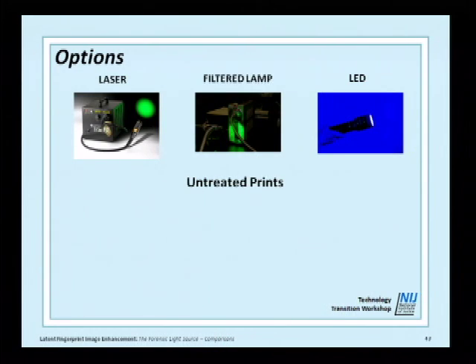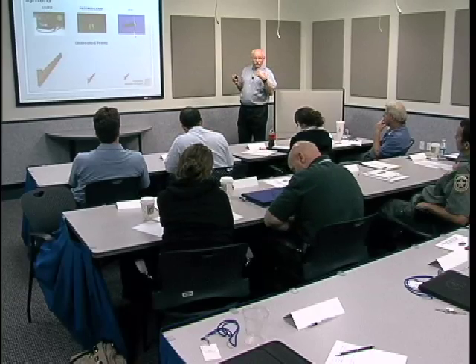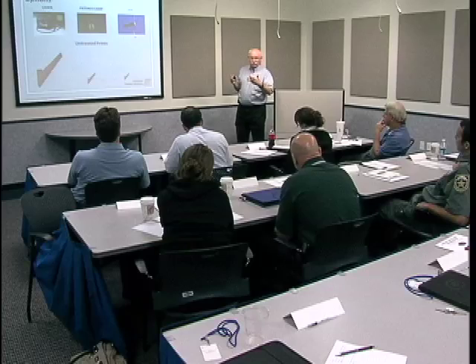Now we come to the other area. Untreated prints, in my personal finding. But again, as I said before, there are occasions, there have been occasions, and all of these, I must tell you, all of the ones have come to my attention in about the last 5 years. Prior to that, I was not aware of any untreated fingerprints responding to light source.